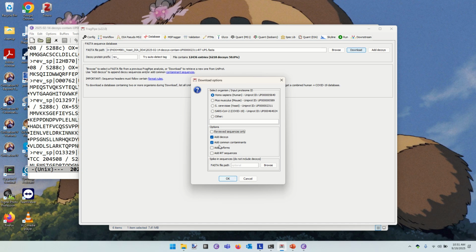If you're trying to make sure your chromatography is bulletproof, you stick in the IRT peptides. Yeah, it's not a huge issue or necessarily commonplace. It might be that the question you're asking biologically requires knowledge of which particular isoform is present for a protein, because there are different messenger RNAs you can produce from a protein coding gene.